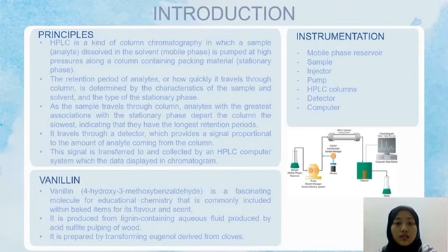As the sample travels through the column, analytes with the greatest associations with the stationary phase depart the column the slowest, indicating that they have the longest retention periods.